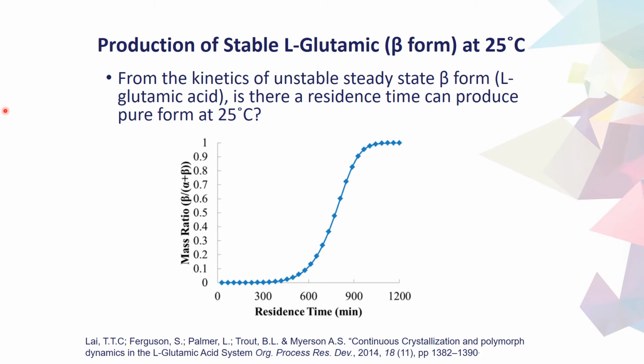With kinetic modeling, population balance modeling, it can be evaluated very quickly. What would the residence time requirement in a single stage crystallization be in order to isolate down to detectable limits only the beta stable form at a 25 degree crystallization isolation temperature? You can see this is over a 900-minute residence time, which is very long and is approaching something very similar to a long batch crystallization. So this would be fairly pointless and not a strategy where you would usually pursue crystallization, particularly for manufacturing purposes.